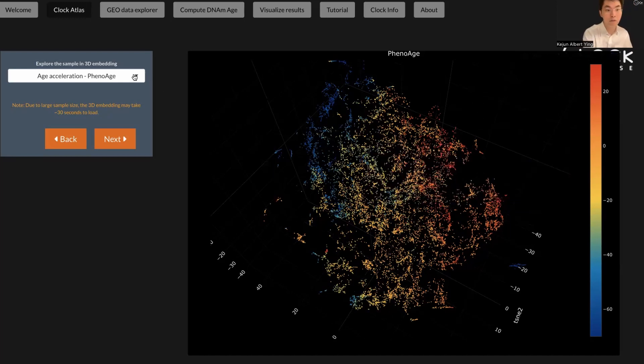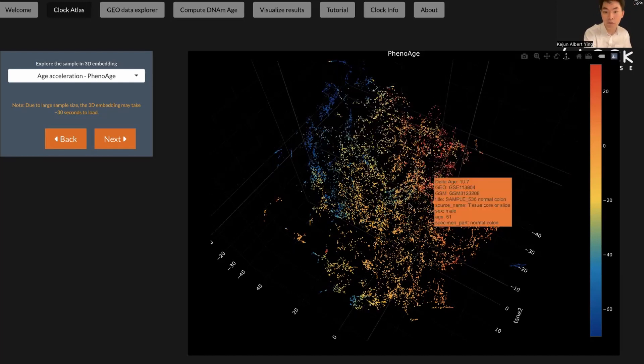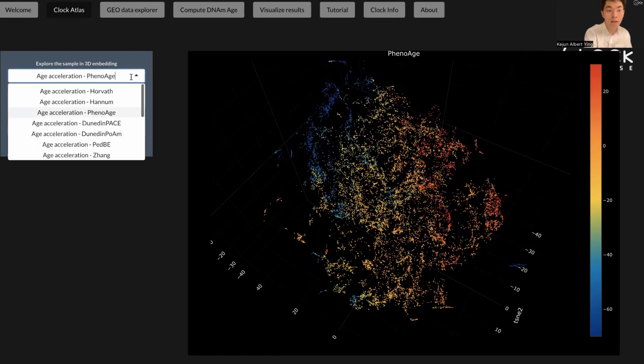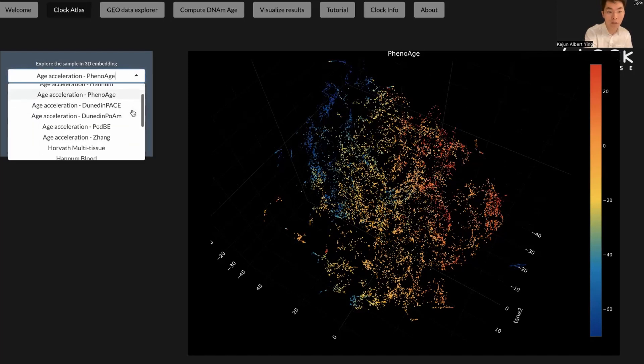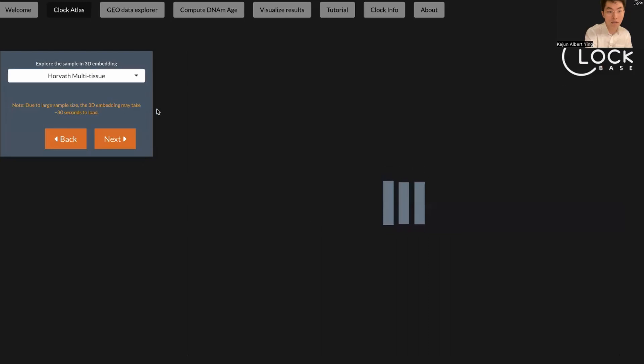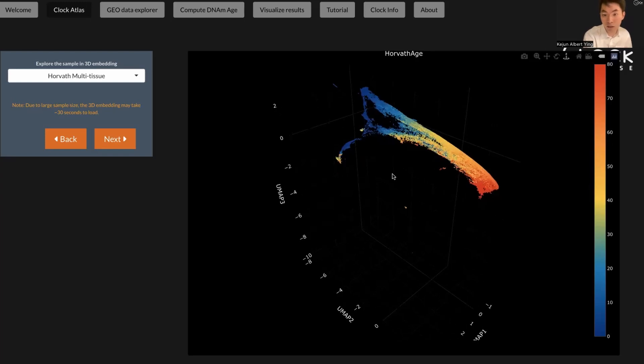Now, of course, if you don't want to explore the age acceleration, but rather if you want to look at the predicted biological age itself, you can also use this 3D UMAP plot. Let's take a few seconds to load it in. Once it's finished loading, you can see this nice trajectory plot.